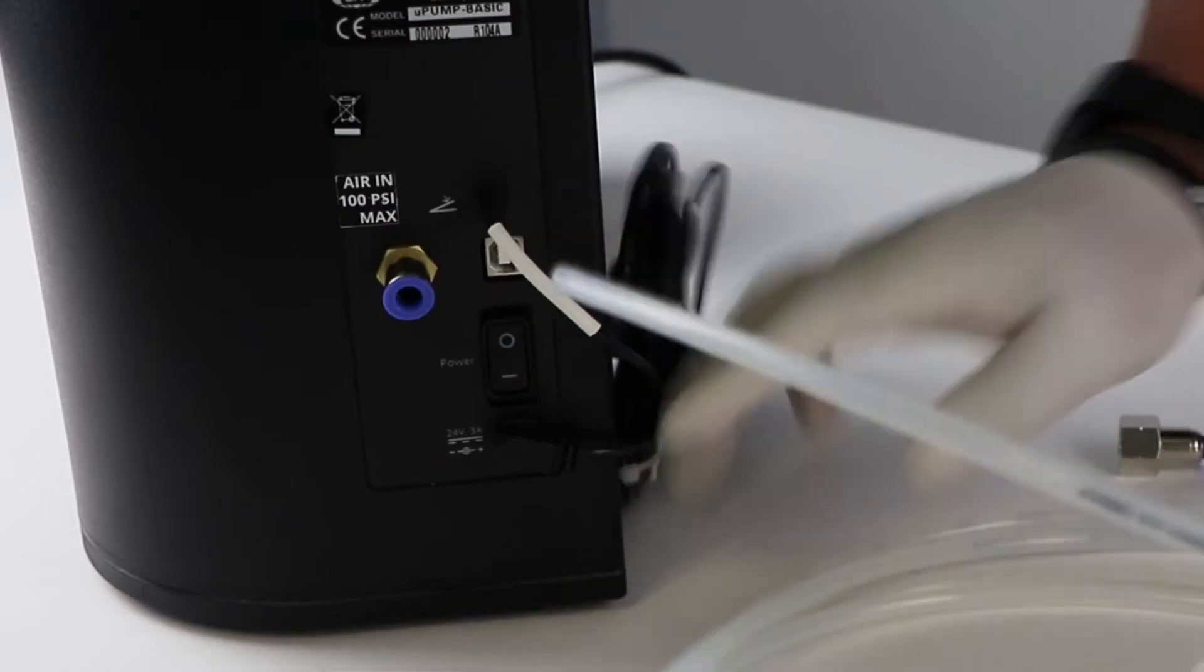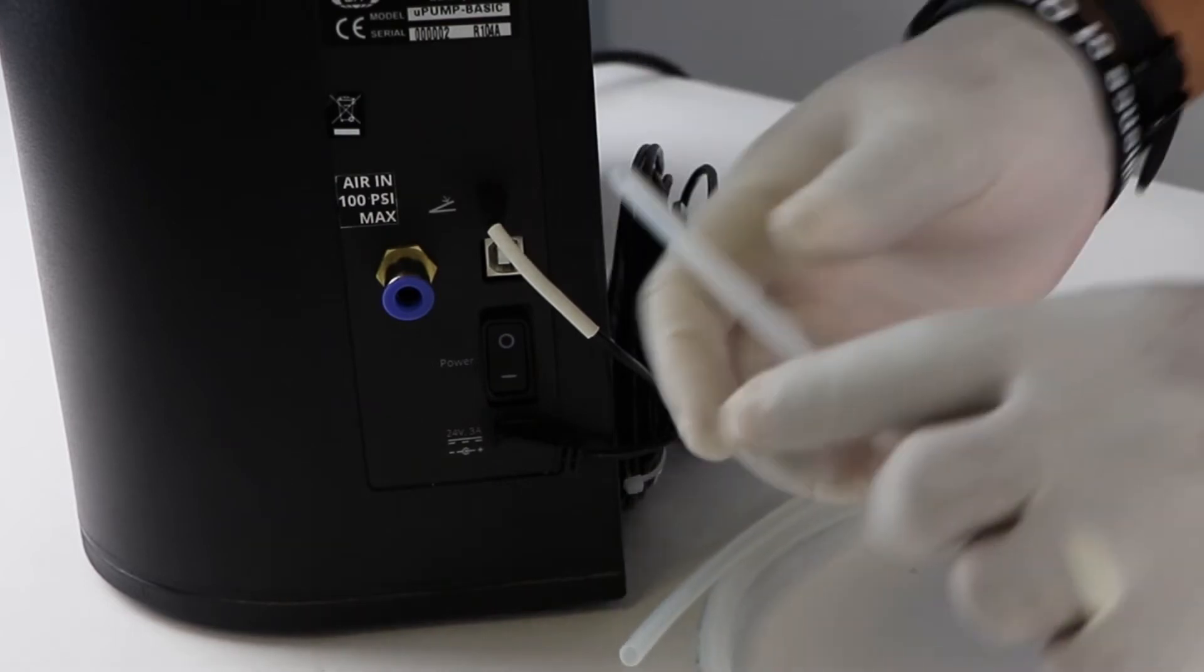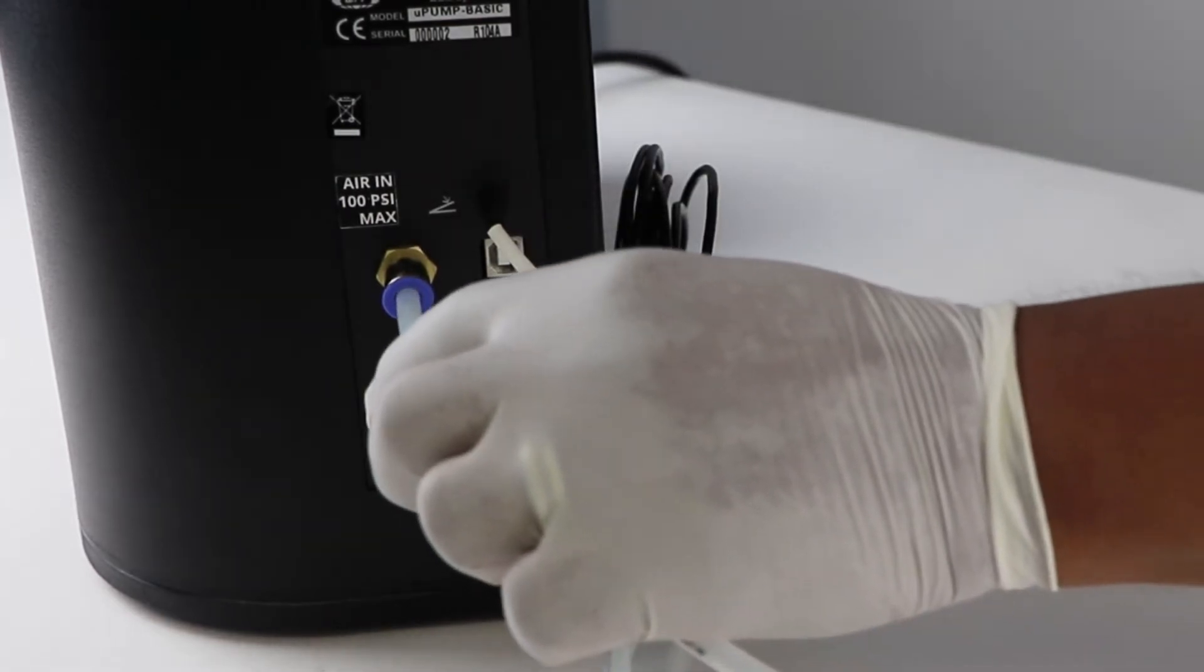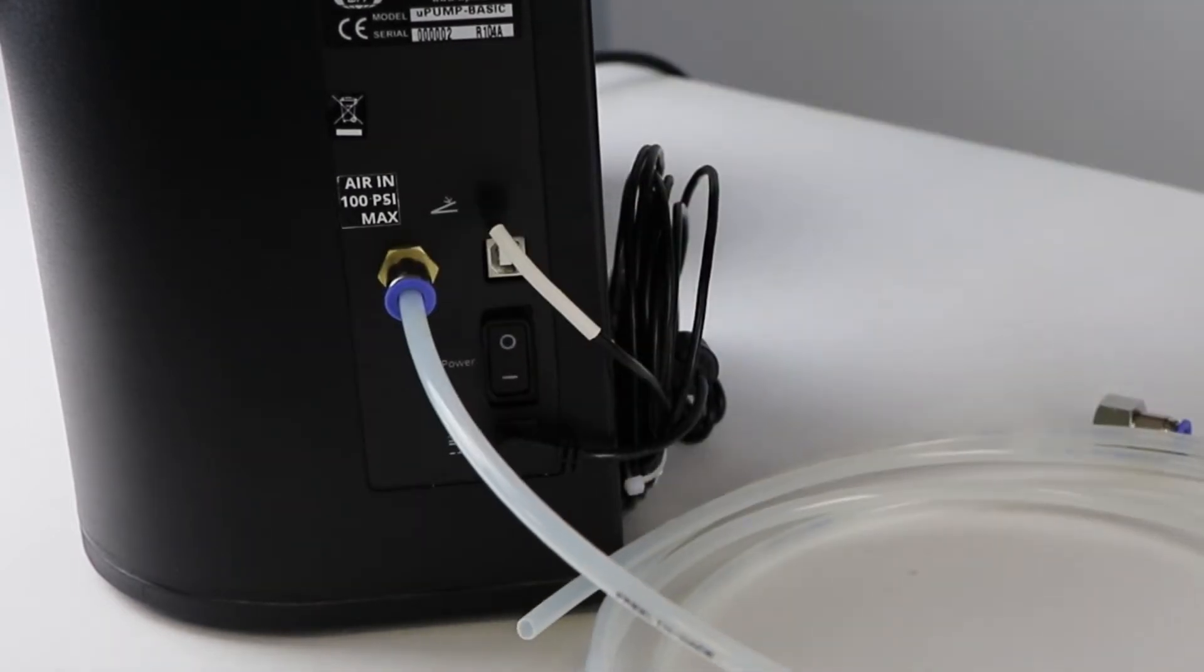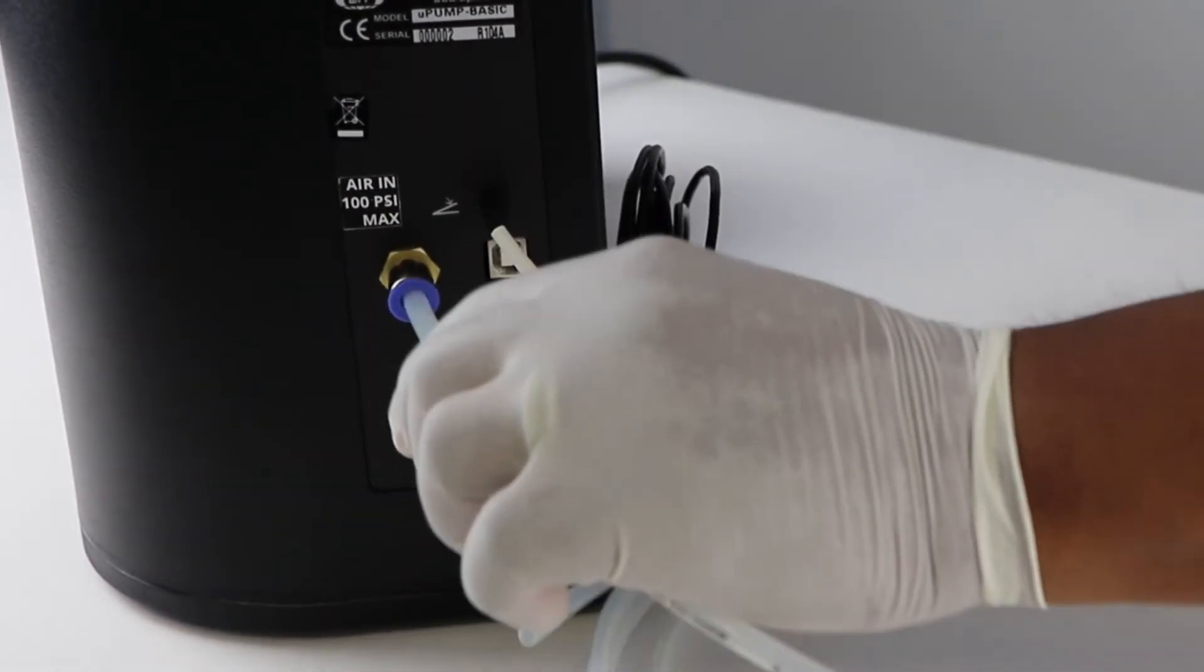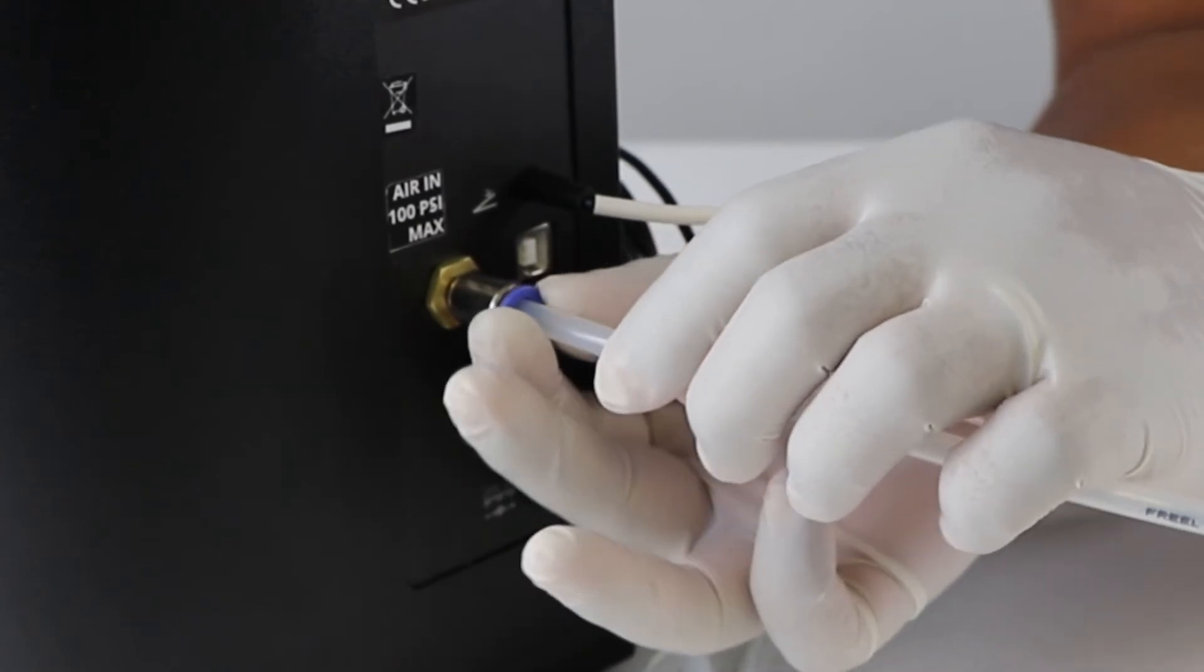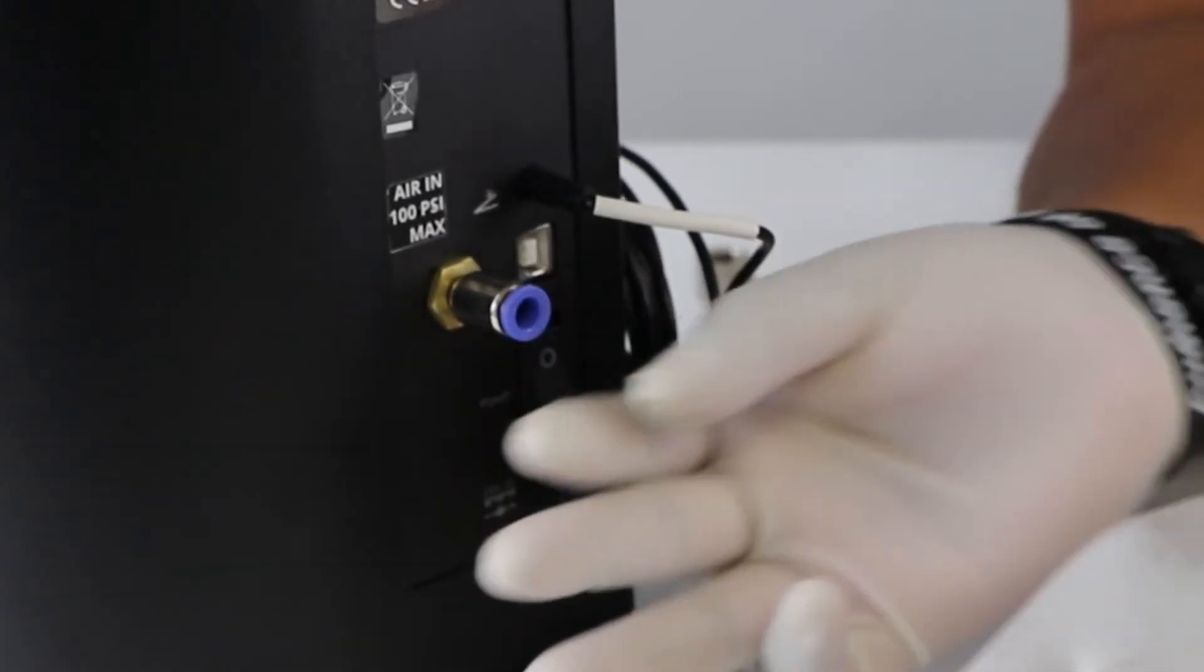To install the hard tubing, firmly insert the tubing into the quick connect fitting on the rear of the instrument. When the tubing is inserted far enough it engages and cannot be pulled out. To remove the tubing, simply press in on the surrounding collar while pulling the tubing out.